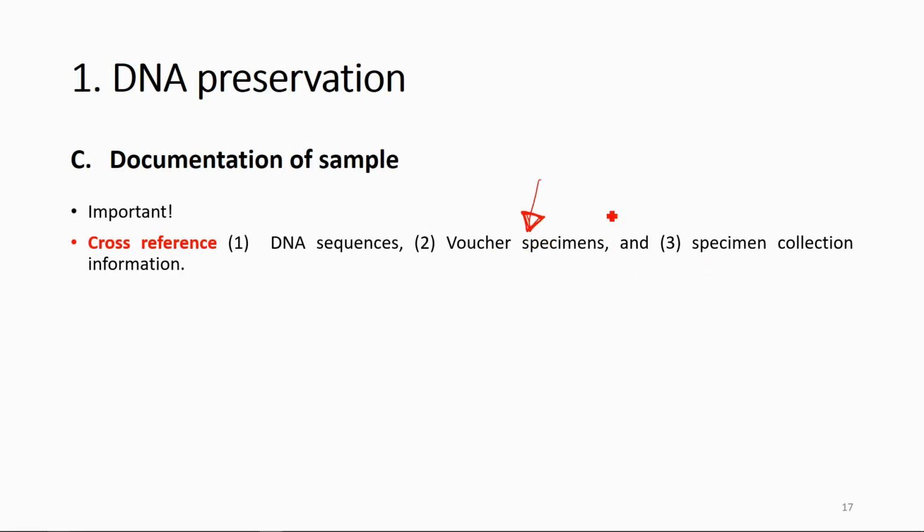And after that, you have the physical specimen. You also need the specimen information. Specimen information is the information that I showed just now regarding the taxonomy, location, collection type, and others. After you have these two, the next thing you can do is to proceed to the molecular work to get the DNA sequence. Okay.